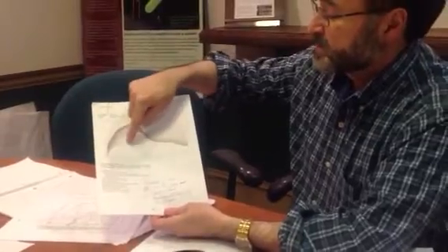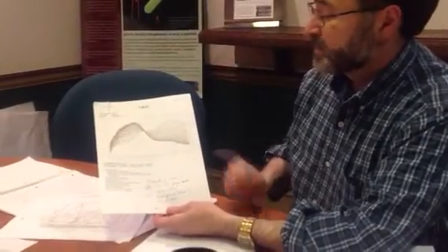And this is going down, and this is going up. So the scatter of bulk cells doesn't interfere with obtaining the spectrum. That opens the door to doing physiological experiments, allowing us to use living, breathing, ticking cells.